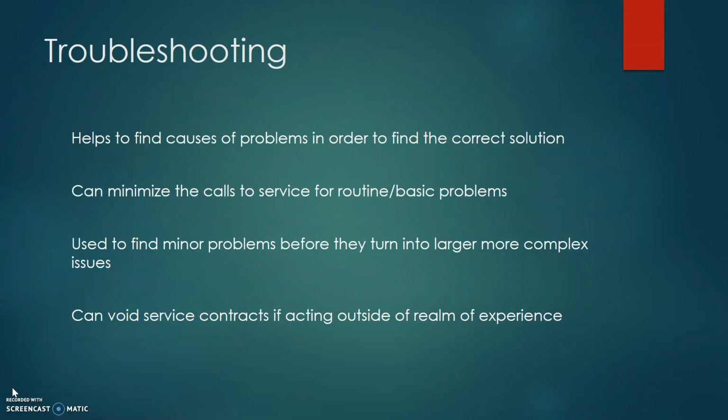Troubleshooting allows us to find causes of problems in order to find the correct solution. It can minimize the calls to service for routine basic problems. It is also used to find minor problems before they turn into more complex issues, and acting outside of the realm of experience can void service contracts.